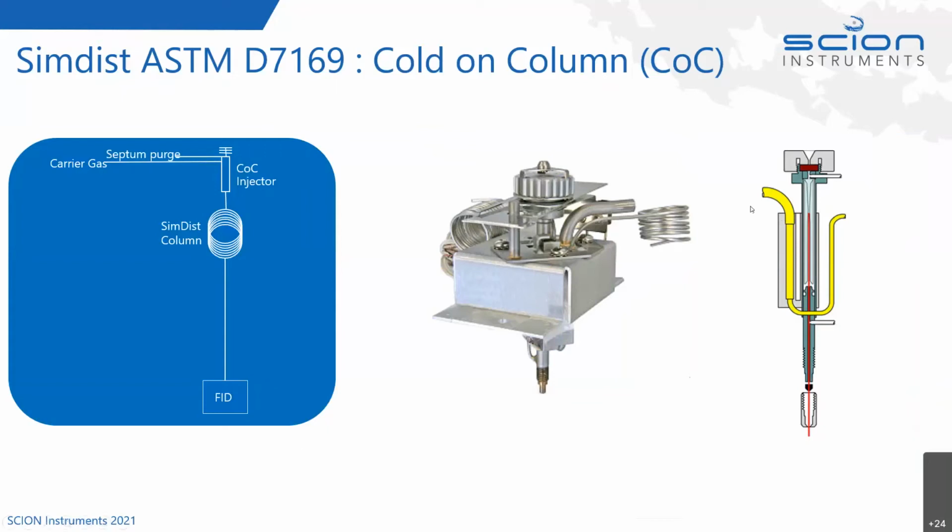In the cross sections here, we have a cooling pipe, the yellow cooling pipe. Now it can be liquid CO2 or it could be liquid nitrogen, liquid CO2 being the most popular. And it has a heater on the side as well, a heater cartridge that's really inside that silver or grey part at the side. So it's very small and compact. It's got a very short nozzle in the GC column area. So there's not a lot of area for cold spots at all. That's why it's very useful in this technique. There's no cold spots really.